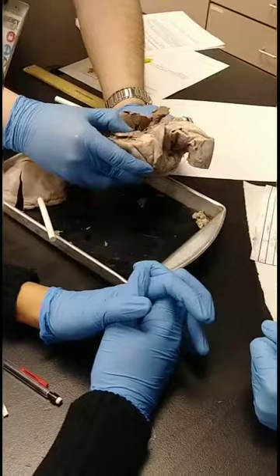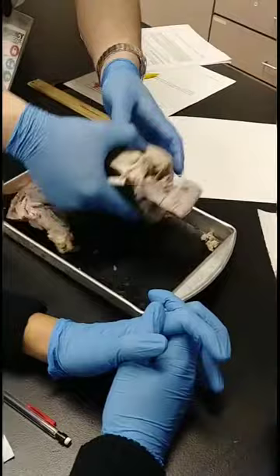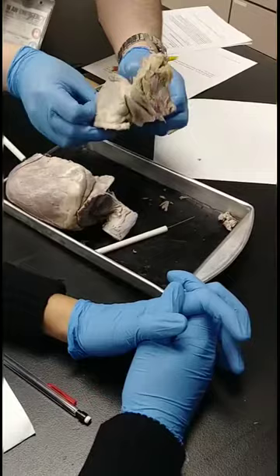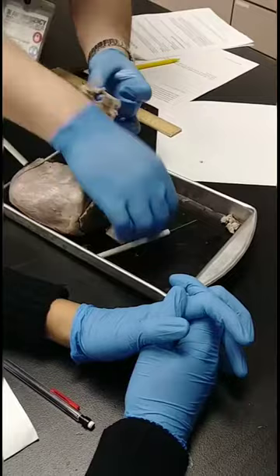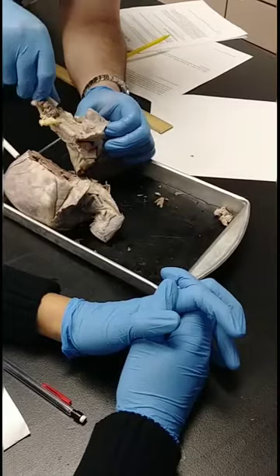All right. So where's one of your probes? So this was, put it back together. This is the right side of the heart, with the right ventricle. Let's open it up and get to that atrium here. Now this here is one of the vena cavae. It's a very thin vein going to the right atrium. So I'll put a pin through there and see how it connects down to the atrium.